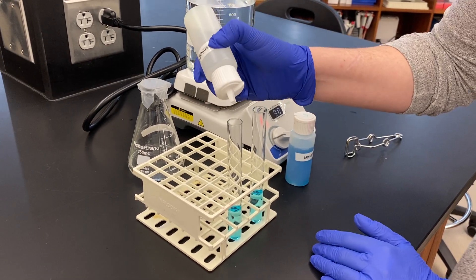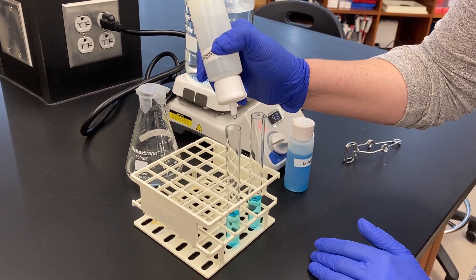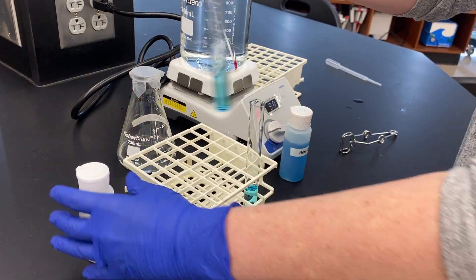So we're going to add 10 drops of DI water and then mix this up a little bit.